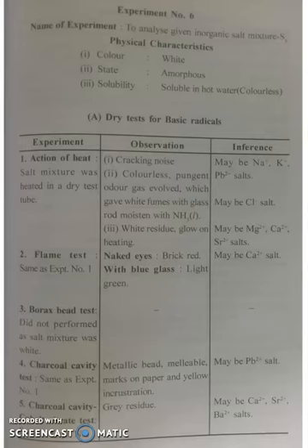Today in this video, I am going to discuss analysis of a given inorganic salt mixture. Maybe the salt mixture's nomenclature is like S1, S2, S3, S4, S5, S6 like that. So just check which salt mixture is given to you. The name of the experiment is like that: to analyze a given inorganic salt mixture.